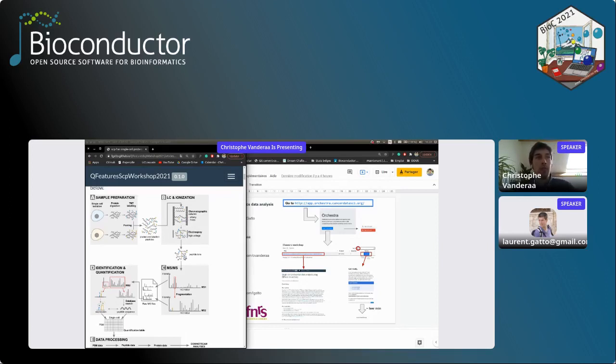analyzable by mass spectrometry. It is a tandem mass spectrometry, so it will create two runs of spectra. The first run allows further discrimination between the different peptides, so a given peak corresponds to one peptide. It will be selected and then sent for a second round. And in the second round, the pattern that you get will give an idea of what the sequence is. Those spectra are stored in raw MS files, and as I said, those are not informative as is, but they can be sent to a software that will do two things.